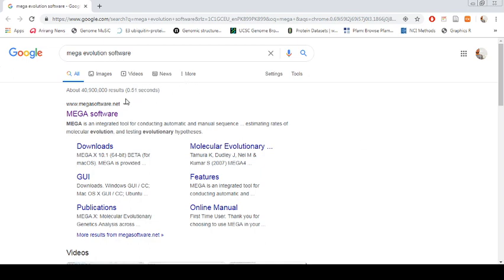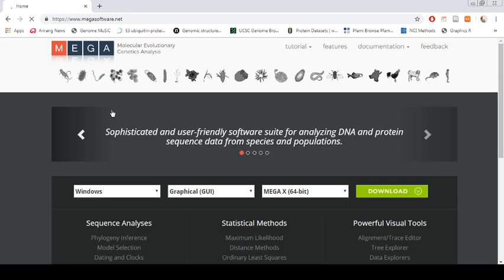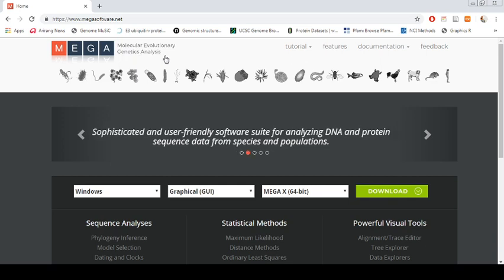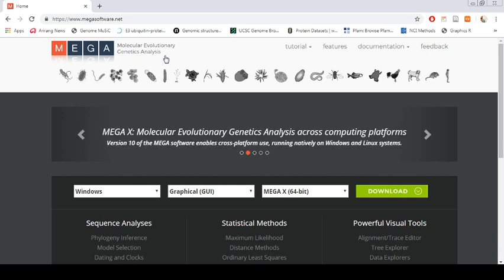I am using the MEGA software. You just go and click MEGA, and from MEGA you now know that MEGA stands for Molecular Evolutionary Genetics Analysis. Just go to this website and you will find here different options.